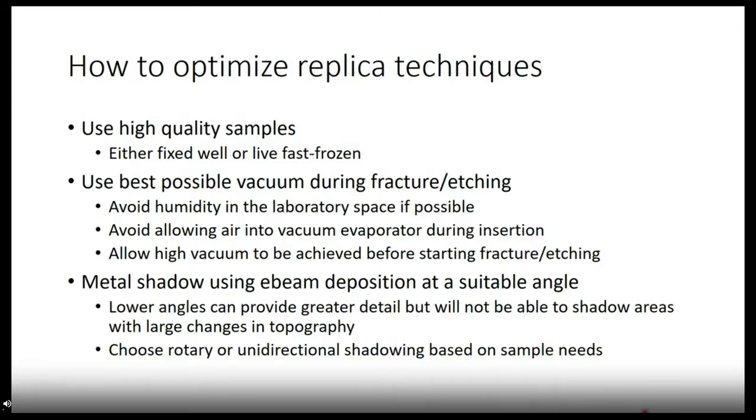If you're going to fast freeze in the high pressure freezer, for example, it's best to get that sample out of the animal or tissue culture, whatever is going on, and into the high pressure freezer as quickly as possible. For a lot of things, this can be done on the order of seconds if you're really good. And this will preserve everything the actual way it is. So you get the highest level of temporal detail. Nothing is degraded yet. It's also really important to get good ice. So it has to be in vitreous ice. If there are ice crystals, they will look very poor, and it's really not even worth fracturing.